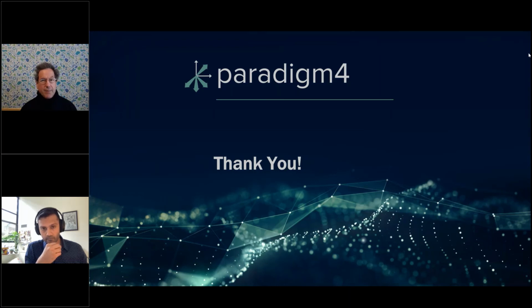And I think it makes a lot of sense for the first sets of projects to be in the analytical development space, where the number of experimental techniques is more constrained, because research is kind of all over the map. So it makes a lot of sense what you're doing. So we're just happy to participate and to help promote what you're doing and enable the scaling, right?